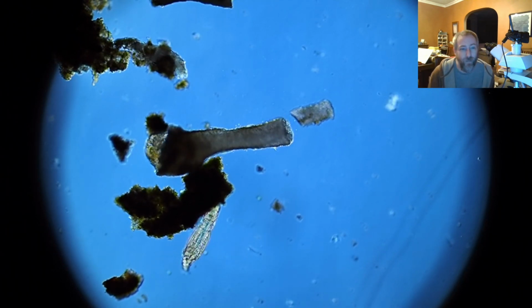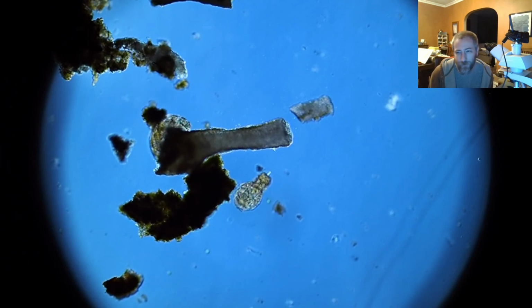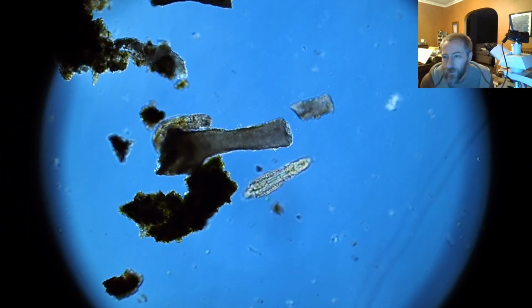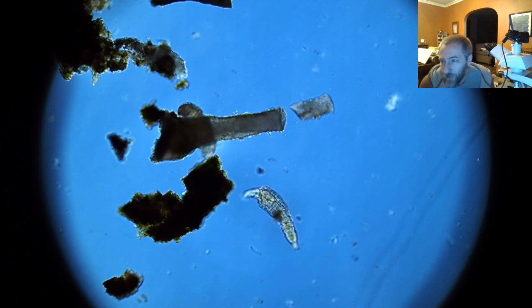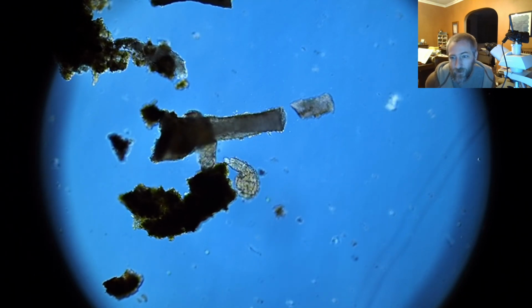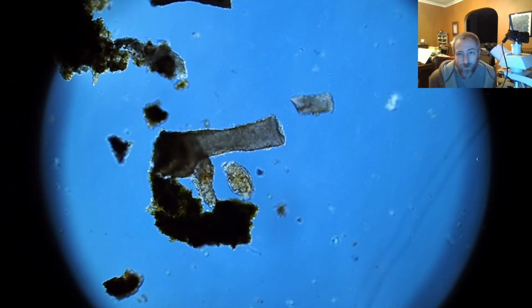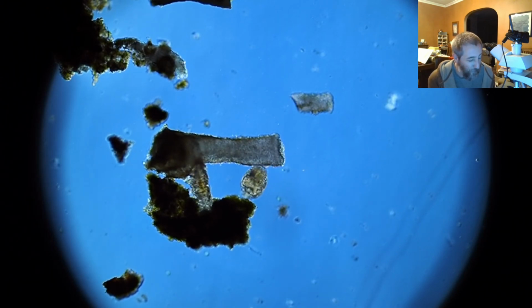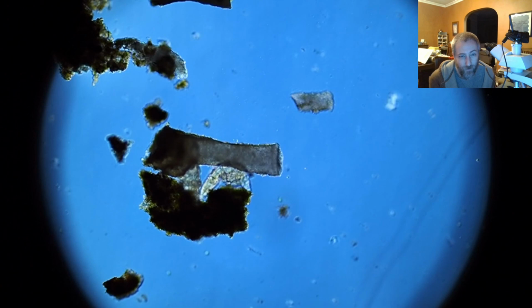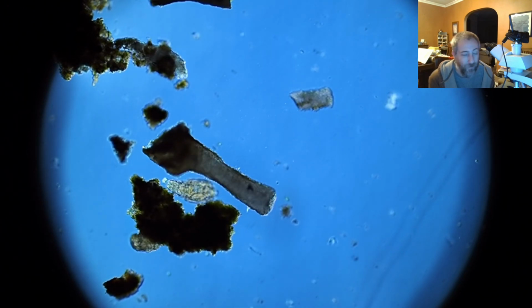If I wanted to get something live with organisms moving around, I think this does a much better job of showcasing them. So how could you find some of these? I have my own microscope, and I feel like this would be really fun to do. So yeah, that Leica is super pricey. This is a lab research grade microscope, so you're not going to be able to afford one of these just off the street, and I probably couldn't afford one off the street if I were just buying it.